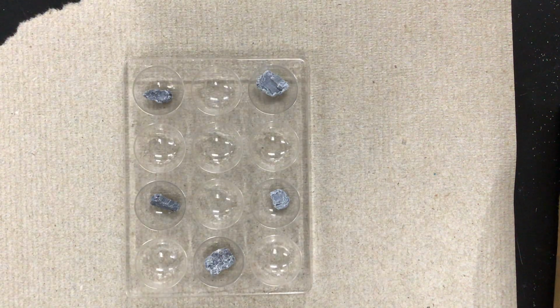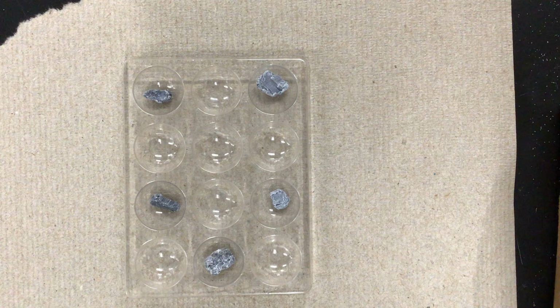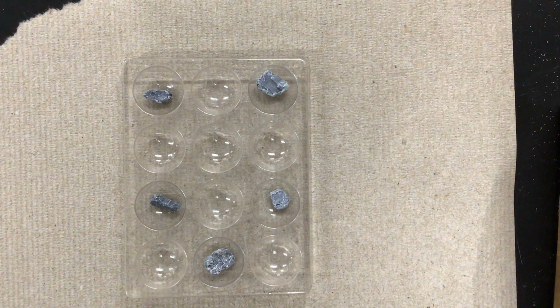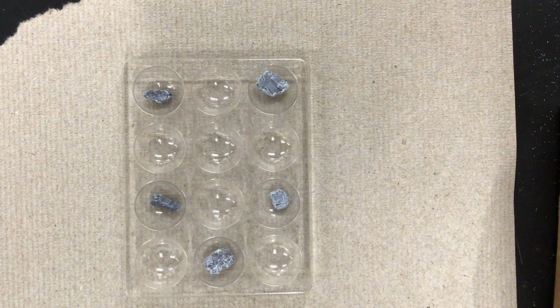So here I've got my calcium in my 5 reaction wells. Calcium is a metal. It's an alkaline earth metal. It's in the second group. And so let's see how it reacts with our solutions. So the first reaction is with silver nitrate.